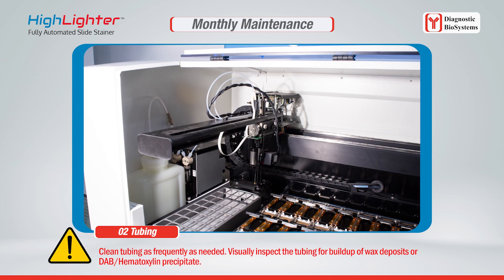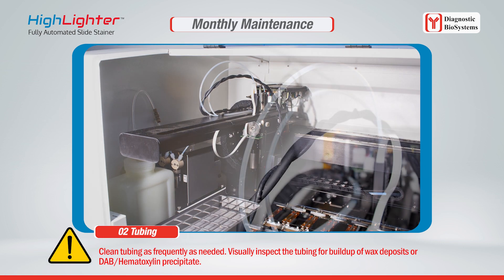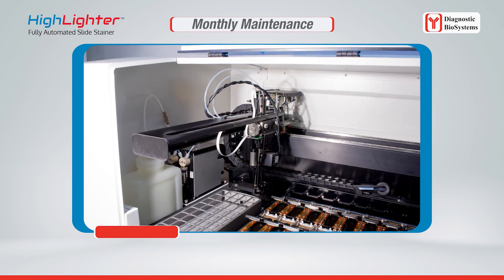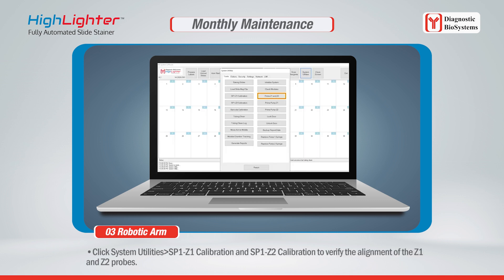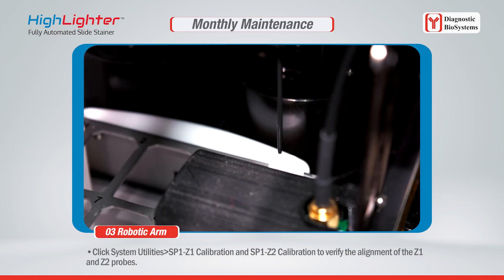Click System Utilities > Tools > Tubing Clean to initiate the tubing clean — refer to Clean Z1/Z2 Tubing for more details. Clean tubing as frequently as needed and visually inspect the tubing for buildup of wax deposits or DAB/hematoxylin precipitate. The robotic arm should be inspected routinely to maintain proper function. Click System Utilities > SP1 Z1 Calibration and SP1 Z2 Calibration to verify the alignment of the Z1 and Z2 probes.